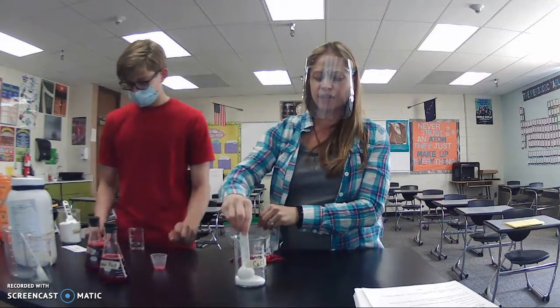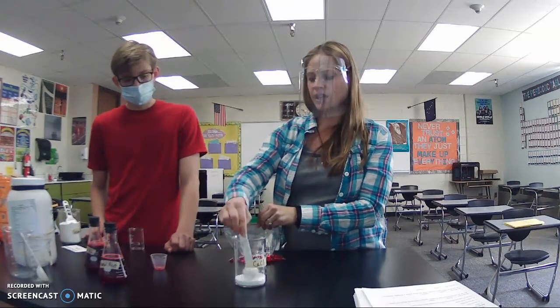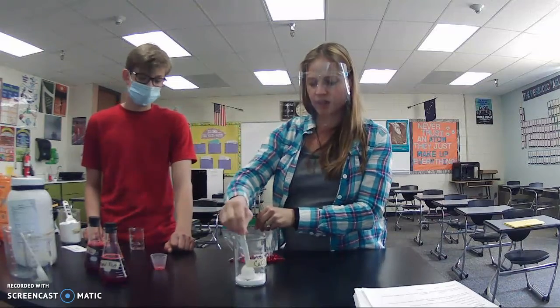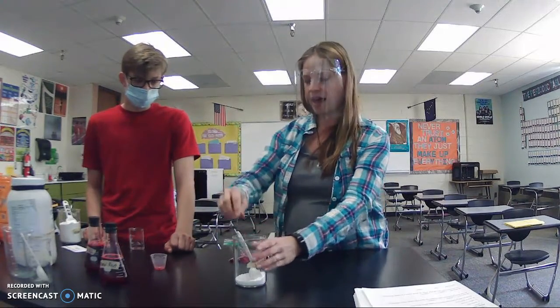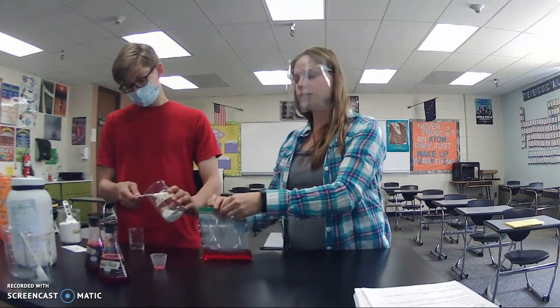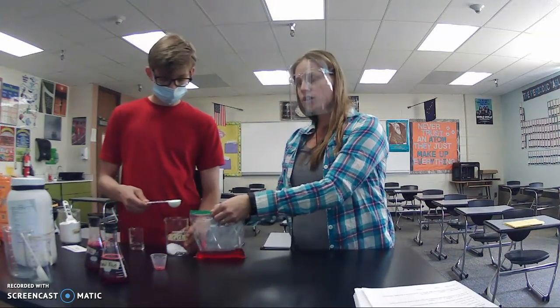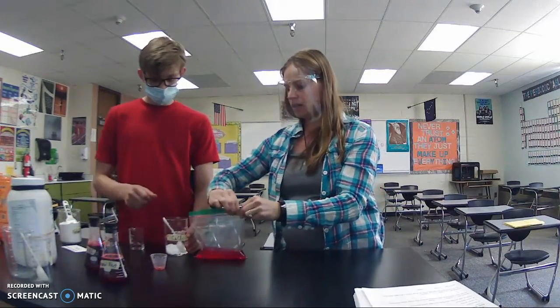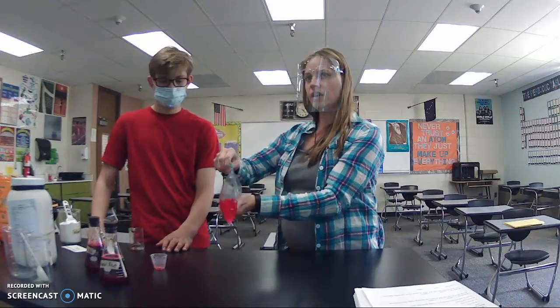It's a very, how would you describe this? It's coarse. It's not as fine as like baking soda or sugar. There are tiny little white spheres. And next, I'm just going to add, or actually you can add calcium chloride to the water, record observations. So, watch closely. We add that, we seal, okay, and then we mix it around a little bit.